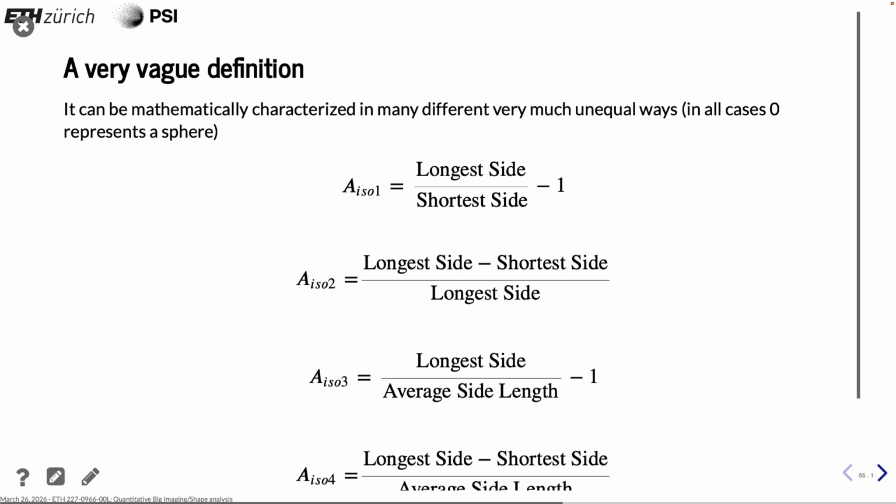In principle, all these metrics are made in a way that a 0 means that it is perfectly round. If it's in 2D or in 3D, doesn't matter, but it would be perfectly round in this case. Or actually, 2D. 3D wouldn't. It could be one dimension could be actually stretching in between.